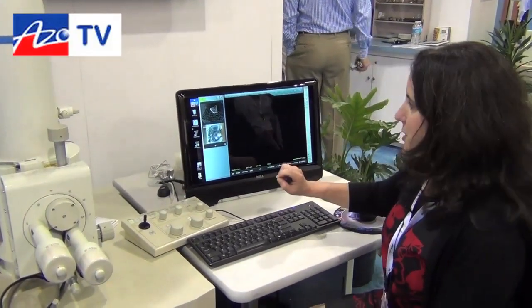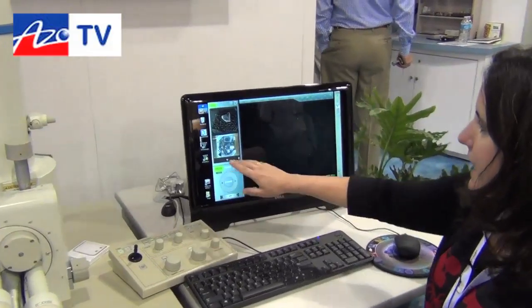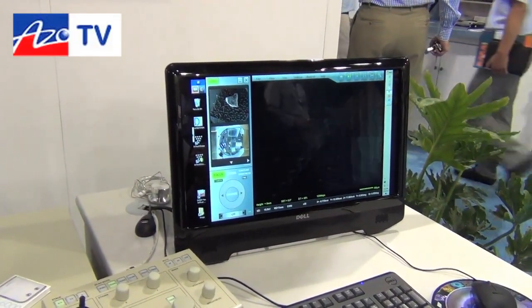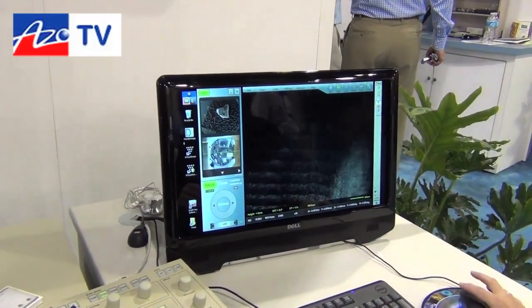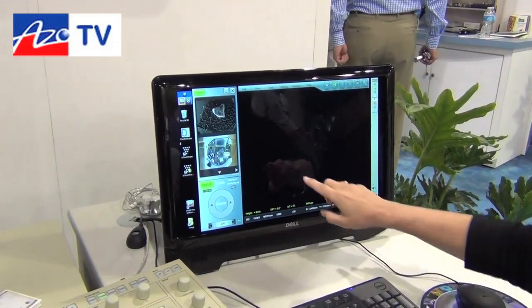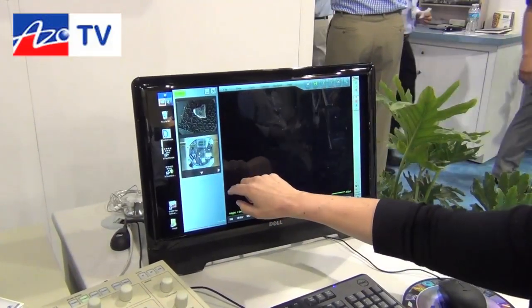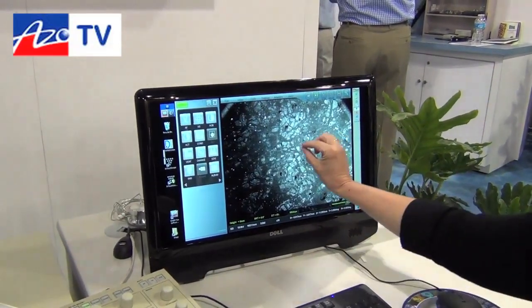There are a lot of automatic features. To turn it on I just turn it on, and from a color image I can drive anywhere I want to in the sample just by tapping on that color image. I'm going to move to a geological thin section. I can also drag on the screen, and there are a lot of automated features here.